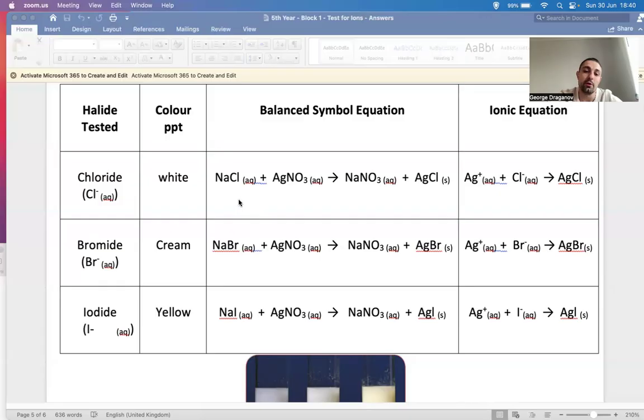So if we see what's going on, you obviously can't just grab a chloride. It has to be part of a compound. So you dissolve some sodium chloride, sodium bromide, or sodium iodide first. To each one, you add silver nitrate. Add a few drops. These will swap. So it makes sodium nitrate each time plus either silver chloride, bromide, or iodide.